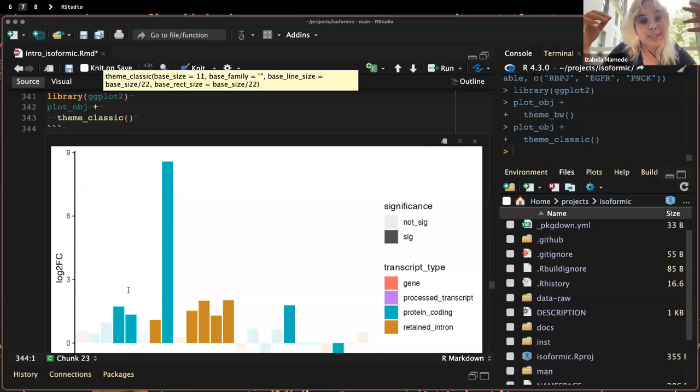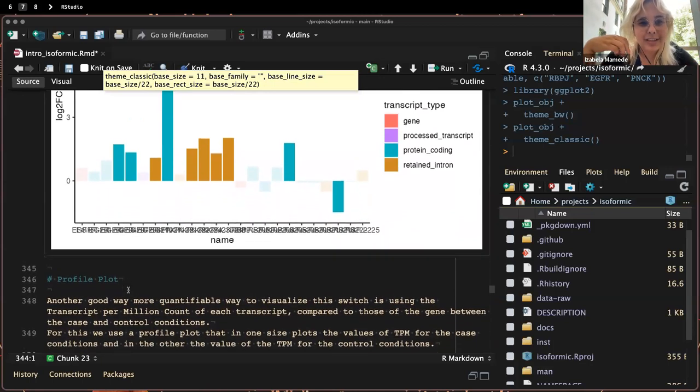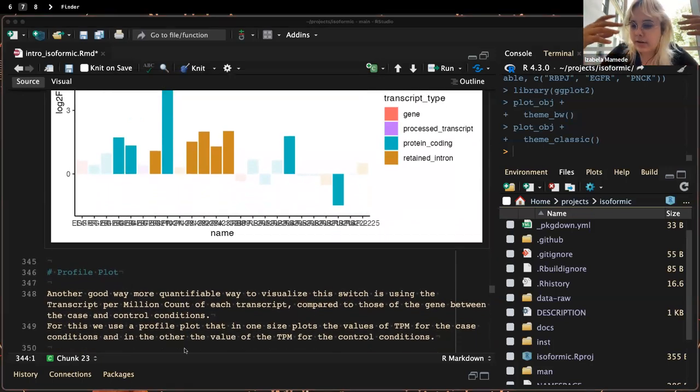Yes, the problem is finding data with the depth to do this analysis, which is not an easy thing. You're completely right, there will be different isoforms in different tissues. I also think the new ENCODE paper explores it a lot, if you want to look at a publication that covers it. As for how to find data, I would go on SRA and check for high depth bulk RNA sequencing in a condition you're interested in. Yeah, or go directly to GEO.